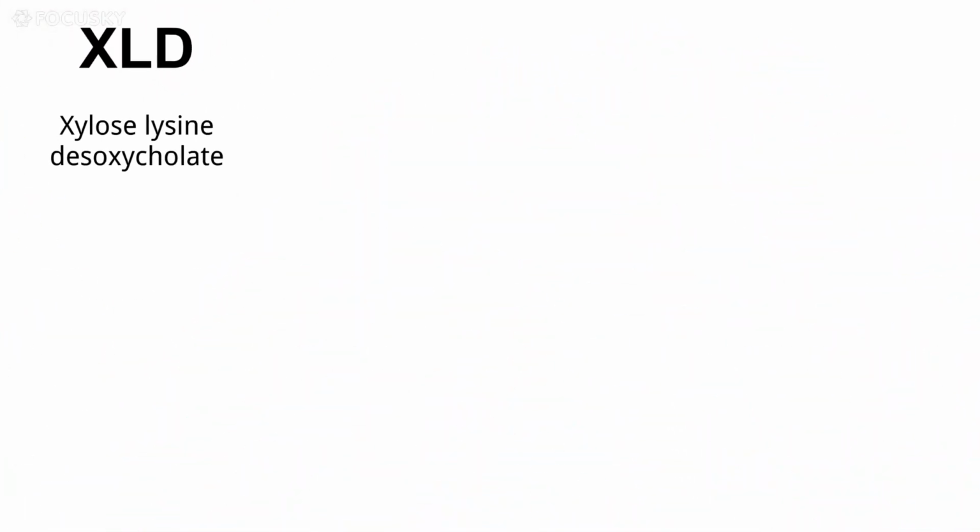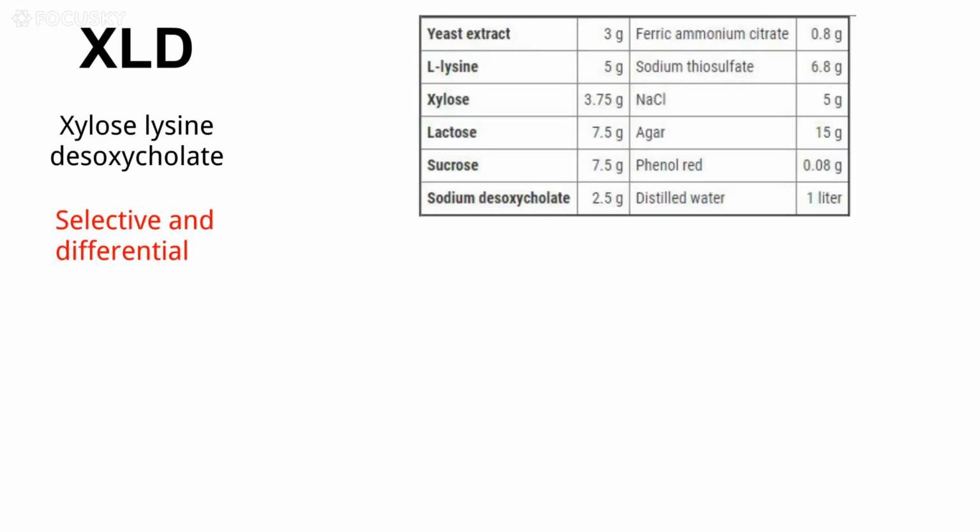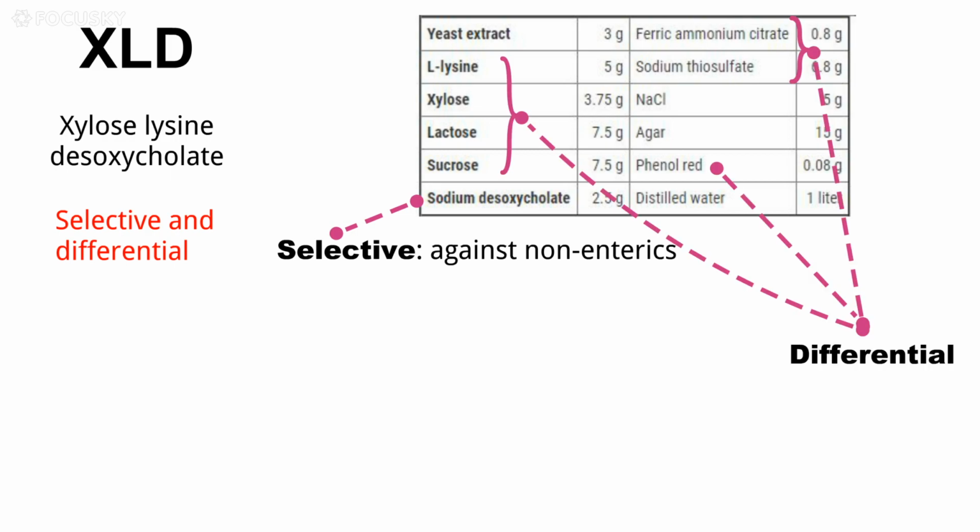XLD stands for xylose-lysine desoxycholate. This is a selective and differential medium. The selective agent is sodium desoxycholate, which inhibits non-enterics. The differential reactions are complicated.